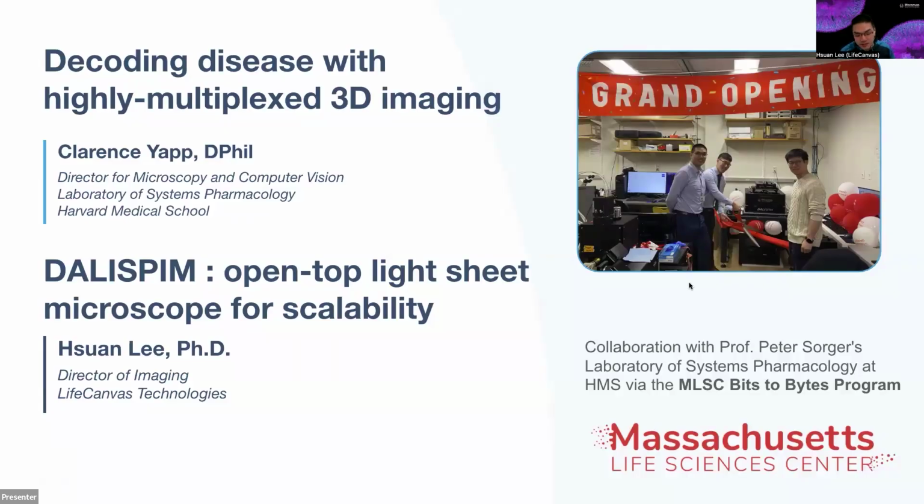For the webinar today, Clarence will first talk about highly multiplex 3D imaging in human FFPE tumor tissue, and how DALISPIM will fit in their workflow moving forward for this project. Following his talk, I will discuss how the DALISPIM open-top light sheet microscope is designed for scalability.